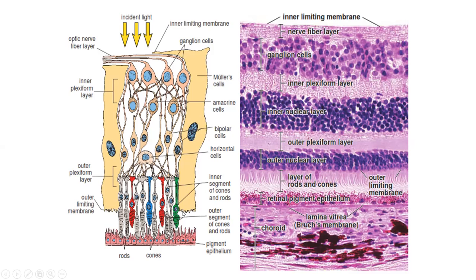It is extending from this layer towards the end, inner side. So this is a very large cell, Muller cell. It is basically a supporting cell, and outer limiting membrane is formed by these two adhesions. So next comes the fourth layer, that is outer nuclear layer, this one.